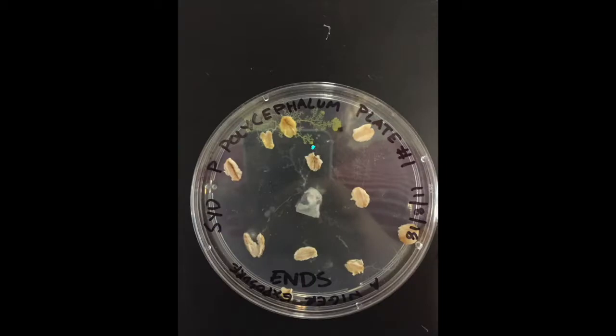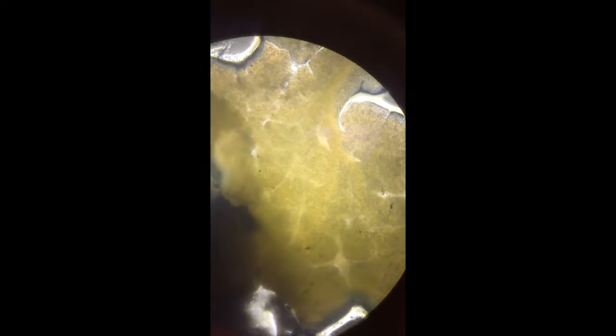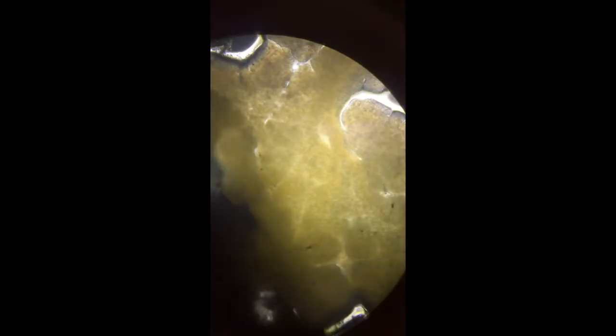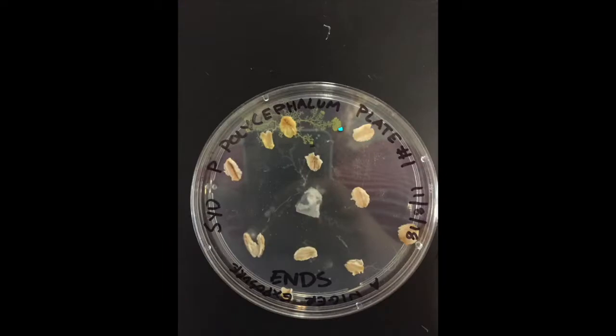This is the plate where I plated the black mold at the ends of the slime mold. Looking at the black mold point on the left, first we can see the nutrient flows kind of doing their normal business. Because the black mold is plated at the ends, it's not directly on top of the slime mold, so the slime mold continues to kind of grow towards it in the pattern it had established beforehand.